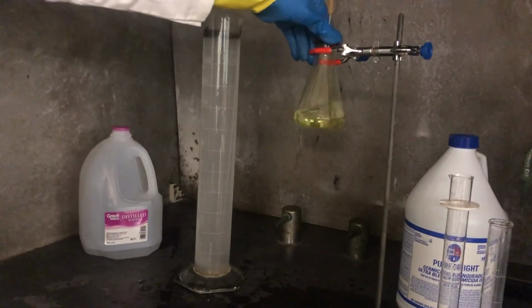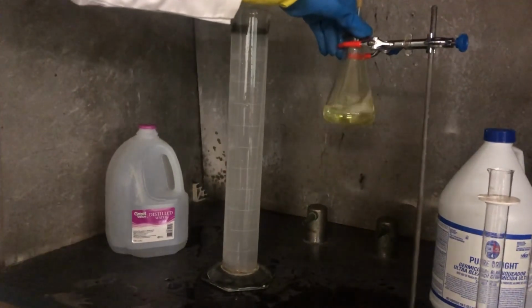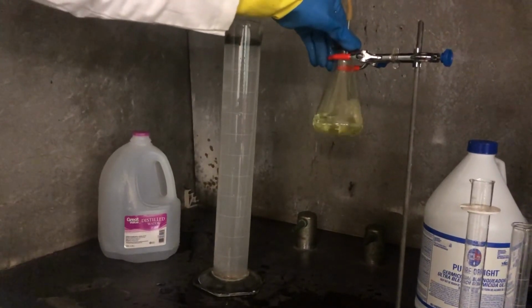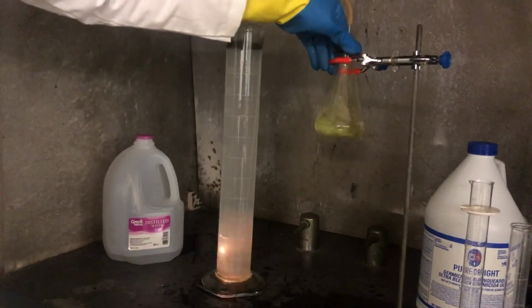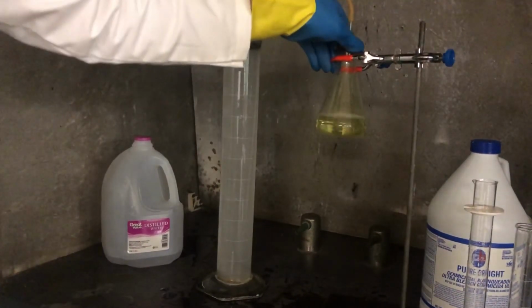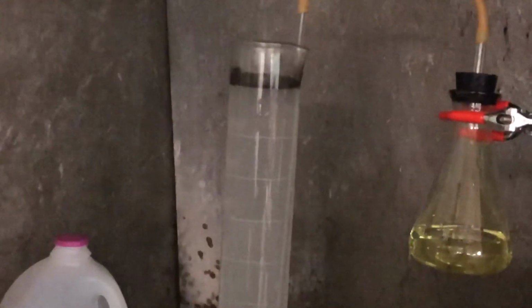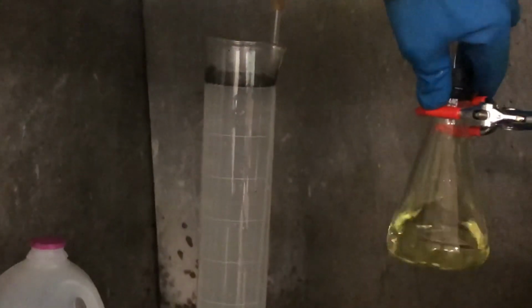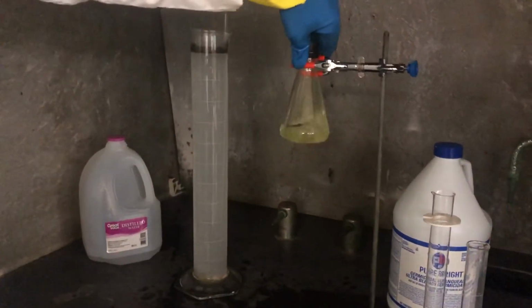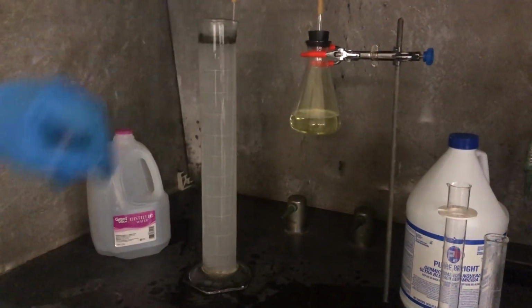See a little bit of the soot occurring in the areas that explodes. There's even some at the top, you can see it occurring there with the two reactions. I have to keep shaking it to get more chlorine gas. Occasionally we have an explosion at the surface.